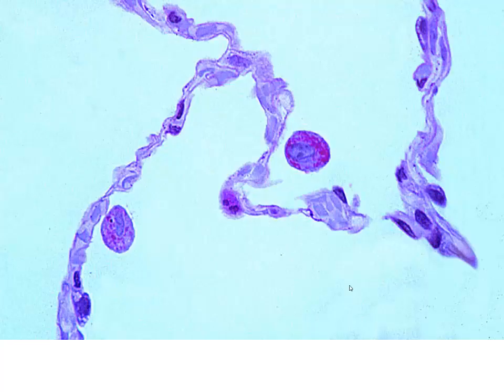Once again, in this particular field, we have our type 1 pneumocytes. We have our vesiculated alveolar cells, type 2 pneumocytes. And then within the lumen, we have our much, much larger macrophages or dust cells.